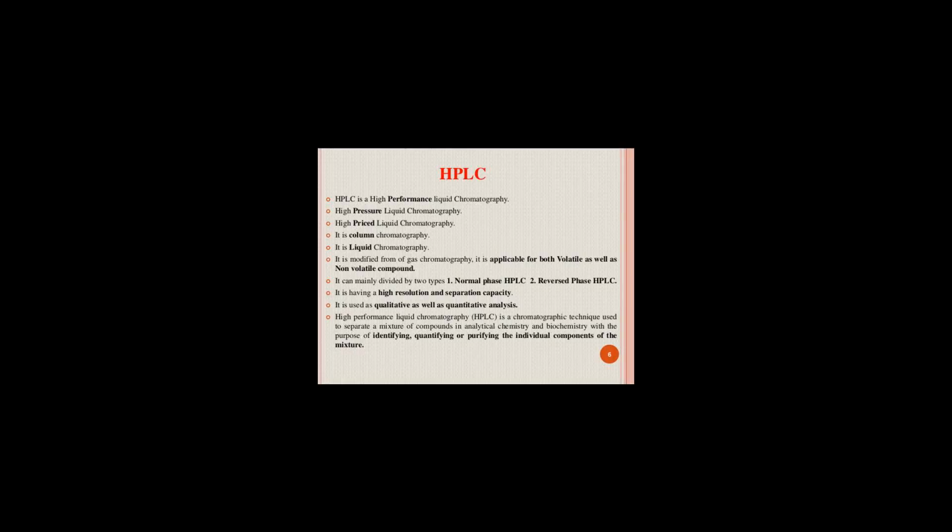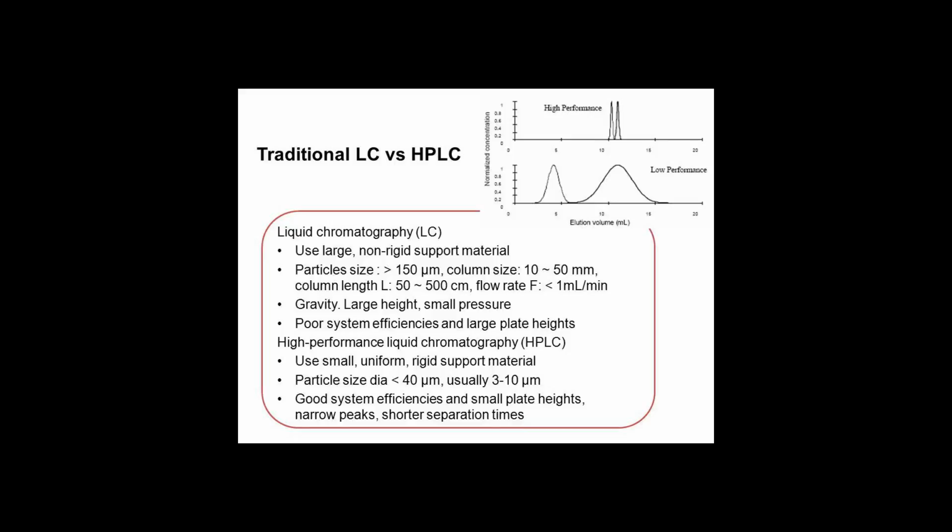Early developmental research began to improve LC particles, and the invention of Zipax, a superficially porous particle, was promising for HPLC technology. The 1970s brought about many developments in hardware and instrumentation. Researchers began using pumps and injectors to make a rudimentary design of an HPLC system. Gas amplifier pumps were ideal because they operated at constant pressure and did not require leak-free seals or check valves for steady flow and good quantitation.